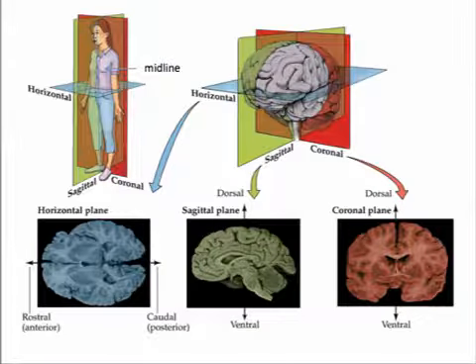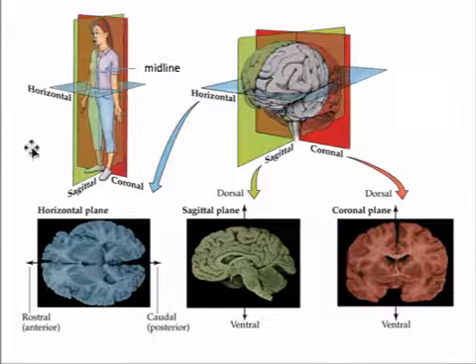So with lab 2, we'll begin to actually dissect our brains. For this lab, we'll be making a cut in the sagittal plane, but overall we'll be making cuts in 3 different planes of dissection. So you'll need to know these planes.